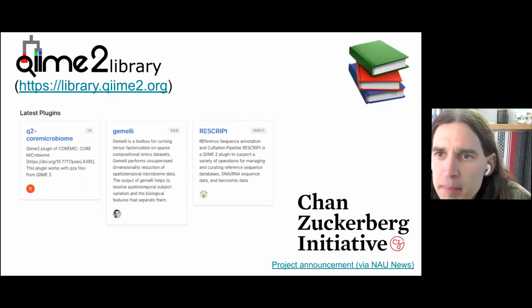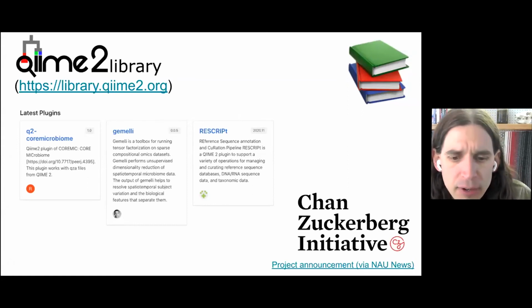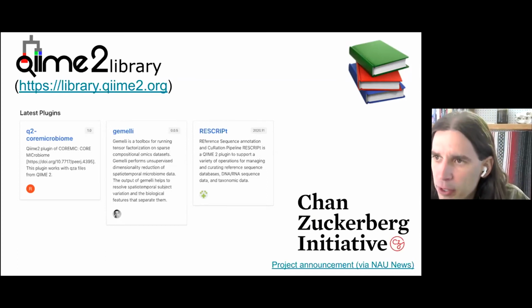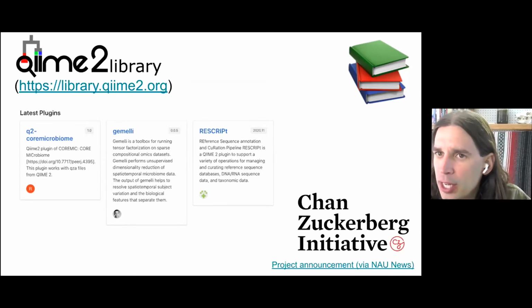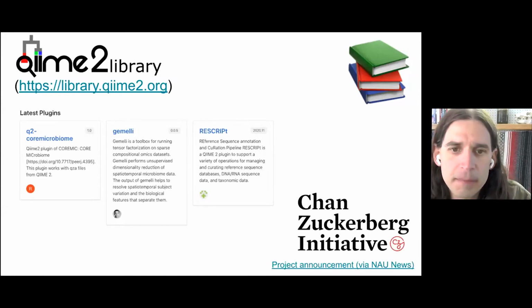We'll also be doing things like building and publishing Conda packages for these plugins, and that'll remove that burden from the third-party developers. A lot of our third-party developers are not necessarily trained as software engineers. They might, for example, be statisticians who are working on building new methods. We find that building and publishing Conda packages is a stumbling point that we're often helping those developers with. And so we're working to simplify that and help the method developers get their methods in the hands of our users more quickly.